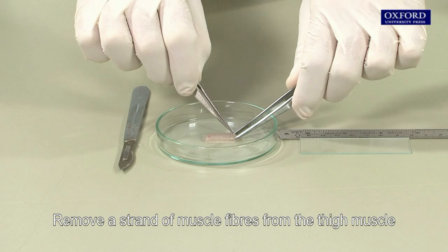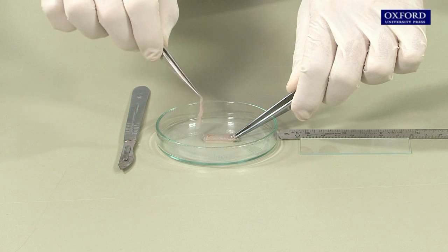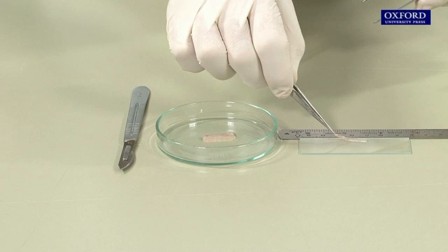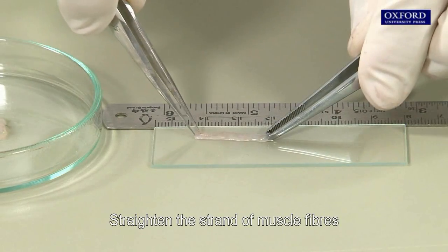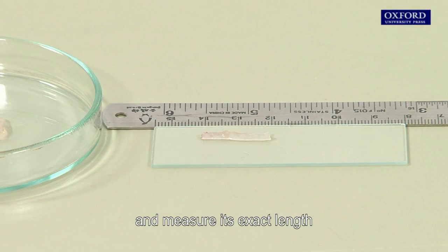Remove a strand of muscle fibres from the thigh muscle and put it on a slide. Cut it to about 2 cm long. Straighten the strand of muscle fibres and measure its exact length.